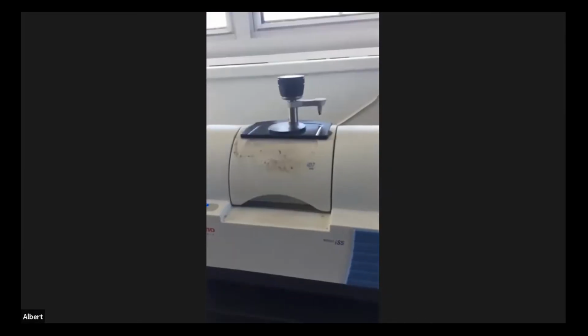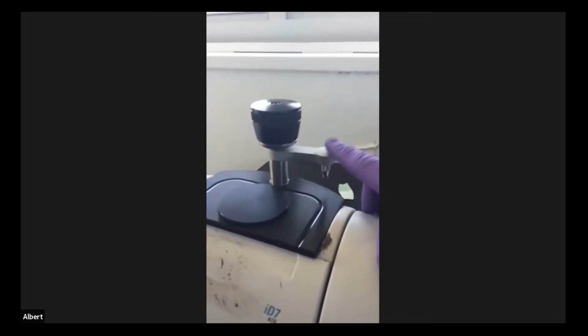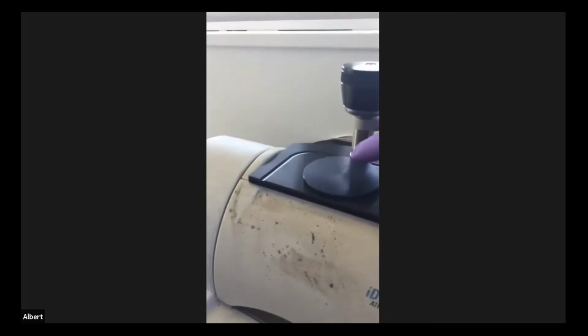All right, so the infrared, the FTIR is here. This is a tiny instrument compared to what a traditional infrared looks like. There's a diamond tip here, and it's that diamond tip that's going to come in contact with the sample, and then the radiation is going to come from here.